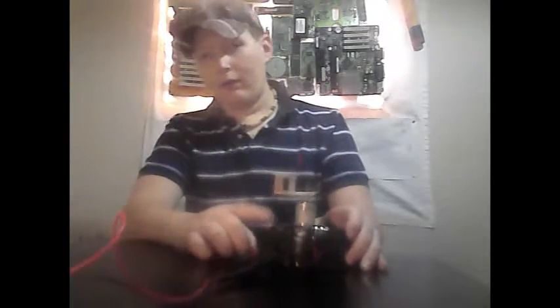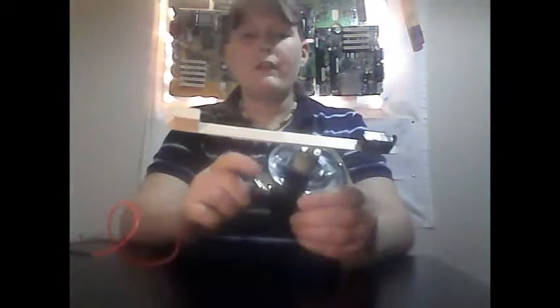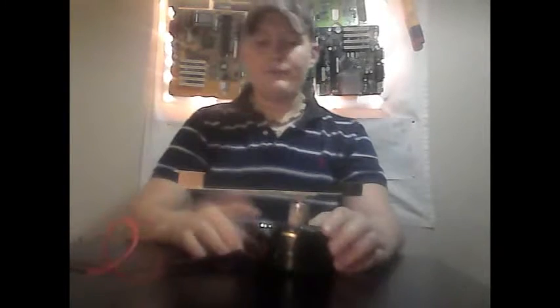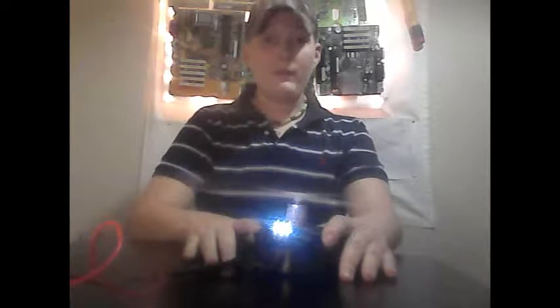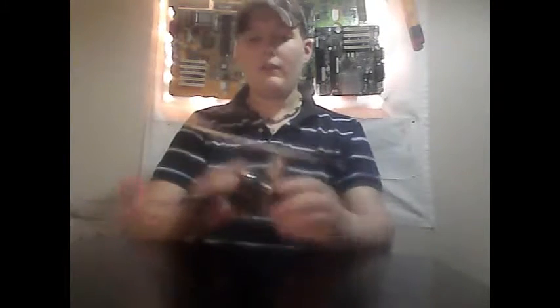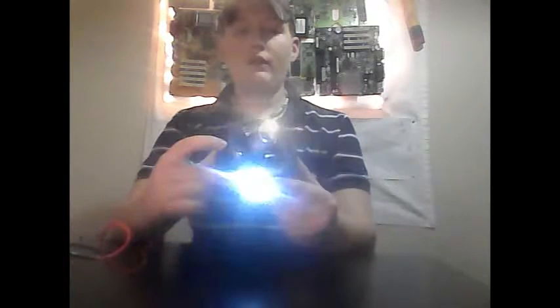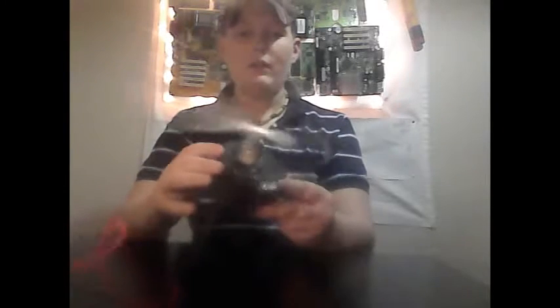There's a little button right here. I don't know if you can see it. There's a light right here. The light indicates whenever it's turned on. Alright, well, you press the button, and it spins very fast. I'll show you how it spins like this. I don't want to do it too fast. I don't want it to fly off. So you can see it does spin really fast.